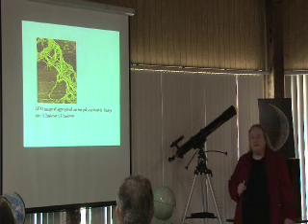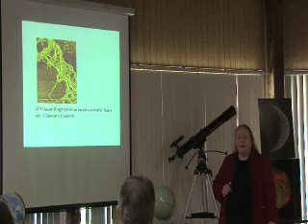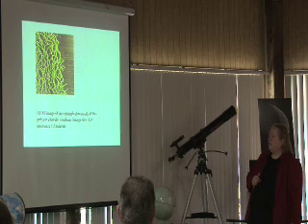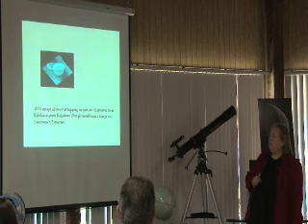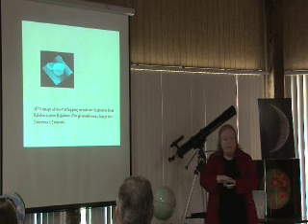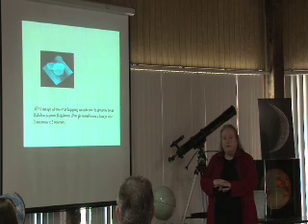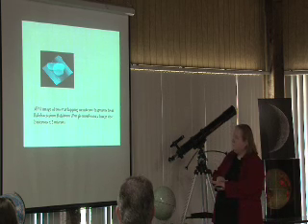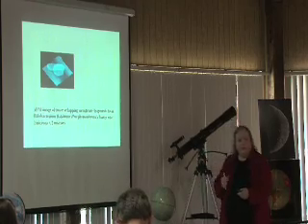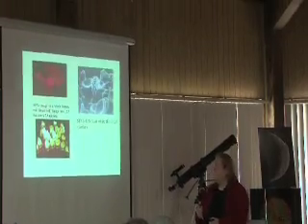You can measure their sizes and dimensions and see if they bind to other molecules and where those molecules bind. This is a tangled network again of something called polysaccharide xanthan. And these are purple membrane filaments. These are from the bacteriorhodopsin, another important biological protein that's being studied that has to do with optics, with light conversion.